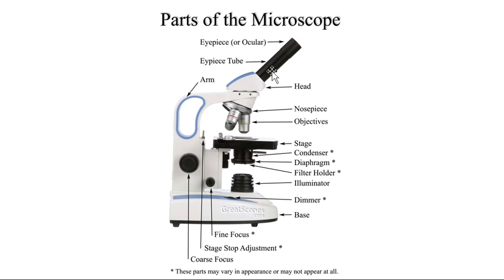This is the eyepiece where we look through. This is the tube, then the nosepiece, and objective lenses. There are different objective lenses ranging from low power to high power and then oil immersion.